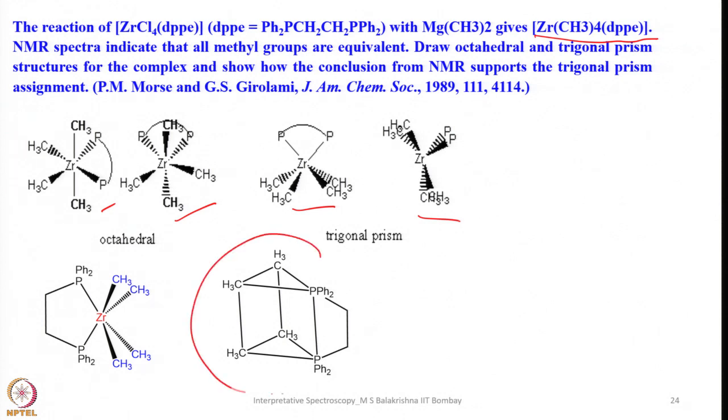And then you can see what I showed through these models. So this is how, once again, NMR can be used to understand the geometry and the preference of groups very readily by simply looking into the corresponding NMR spectra.